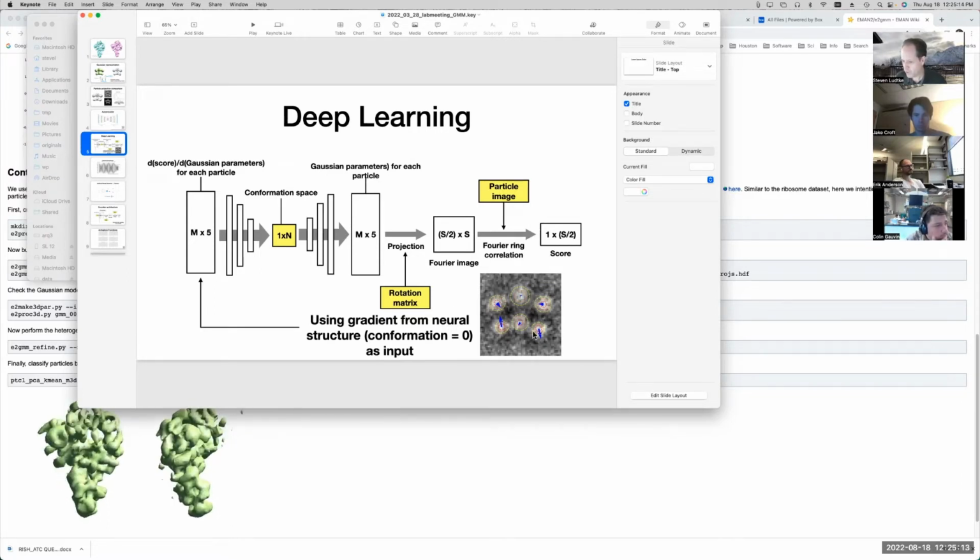So you put in just 2-dimensional information. What you get out is 3D information, and the network is supposed to learn how, as a whole, all of the different 2D particles relate. When you train the network, you're basically training into the network that 3D aspect of it. So then you can put just a 2D particle in, and you can get a 3D version of the particle out.